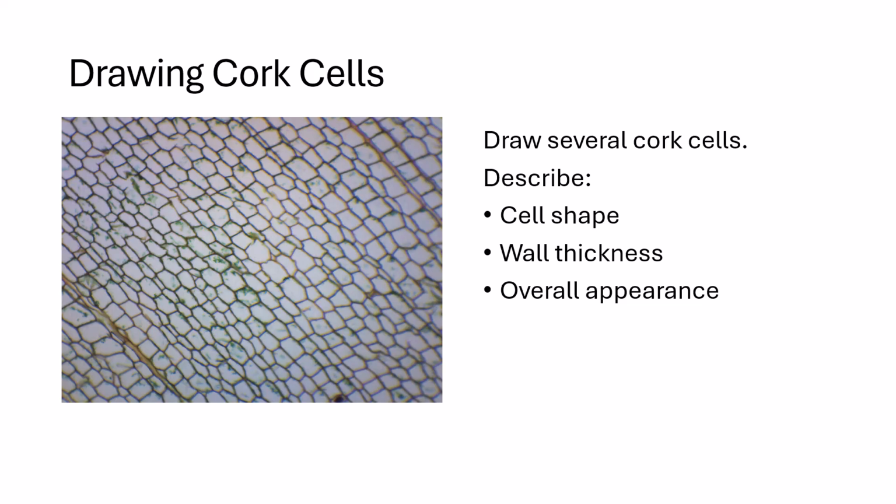Pause and draw several cork cells. Record their shape and wall thickness and describe how this structure relates to protection.